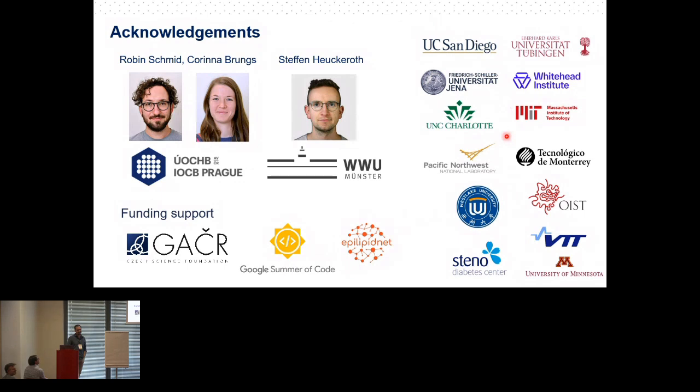Hi, Tomáš. Very interesting, especially the part on the database, because this is something that we also faced quite often. We also realized that the limited number of spectra you mentioned in the public repositories actually only report protonated and deprotonated species.